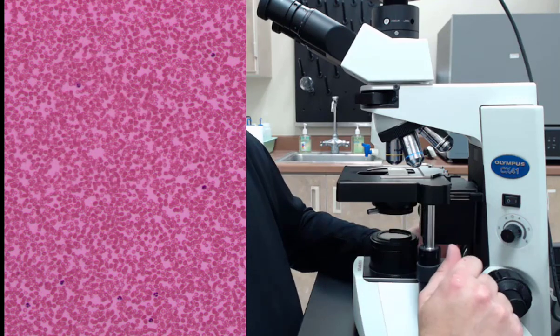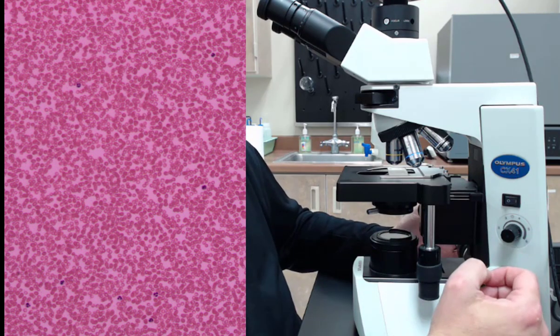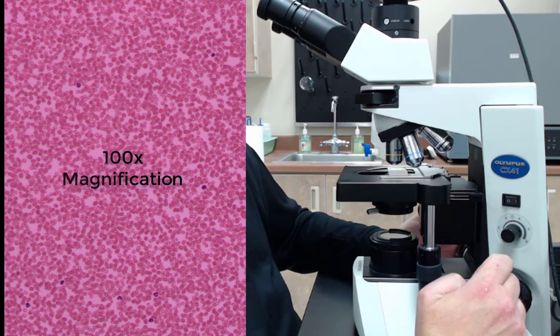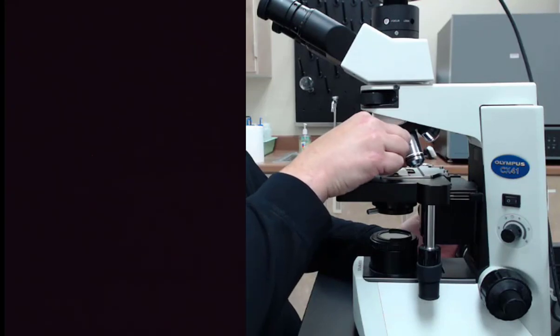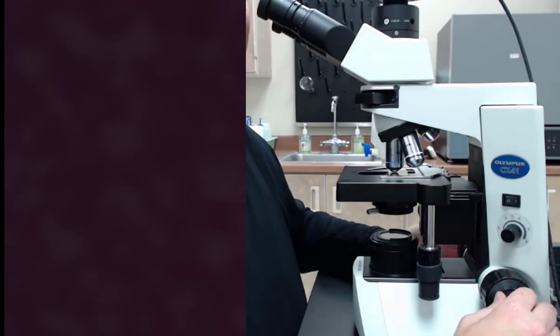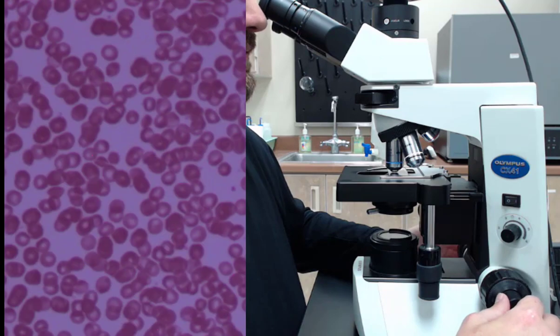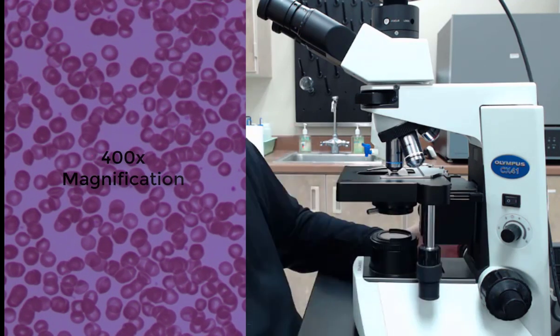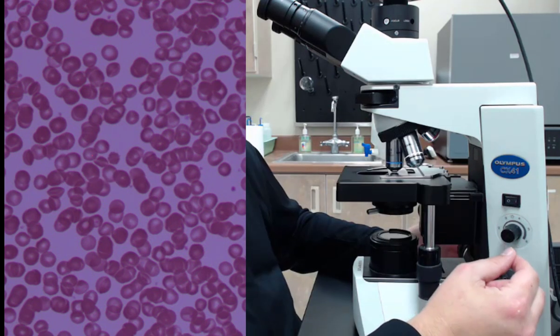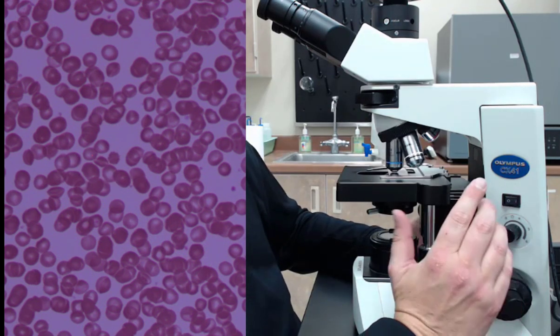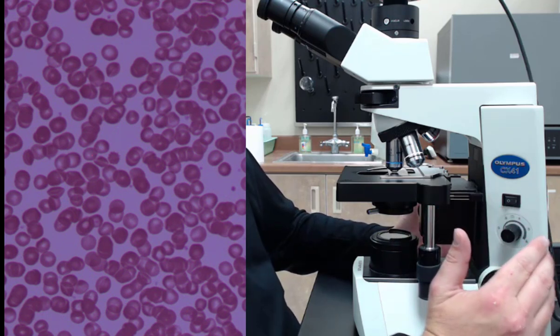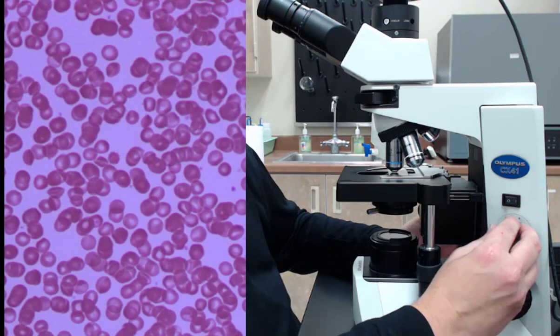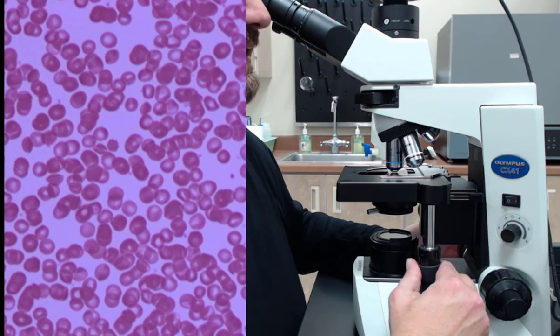Now we're going to head to the high dry power. The high dry power is called that because the highest magnification you can get without using immersion oil, which we'll use when we get to the oil immersion objective. The high dry power has a magnification of 40x. So you take that times the 10x magnification that's in the ocular. And we're now looking at a total magnification of 400x. Now you may have noticed that I had to turn the light intensity up a little bit there. So this is the rheostat knob where you do that. And as you go up in magnification, think of it this way, you're basically using less of the light bulb. So it does get darker. So that's why I turned up the light intensity a little bit using the rheostat knob.